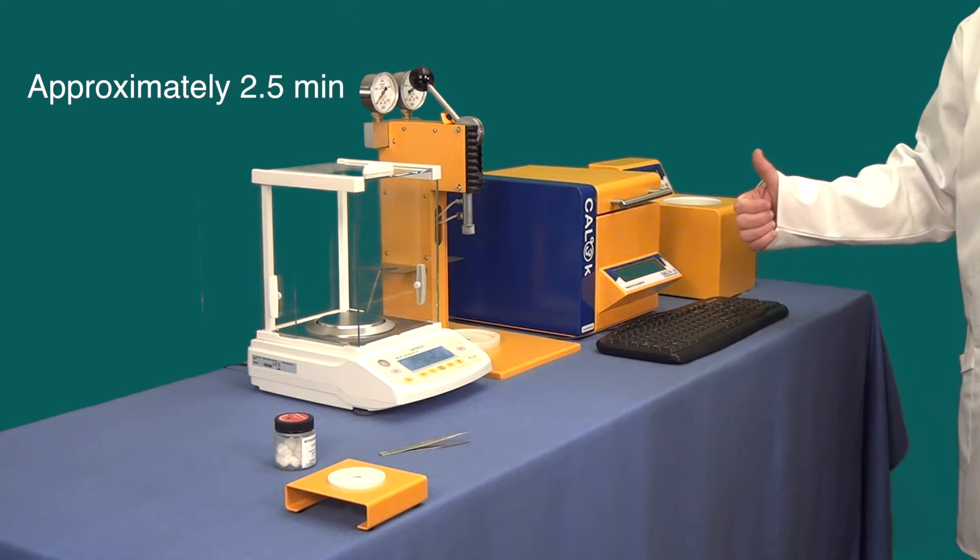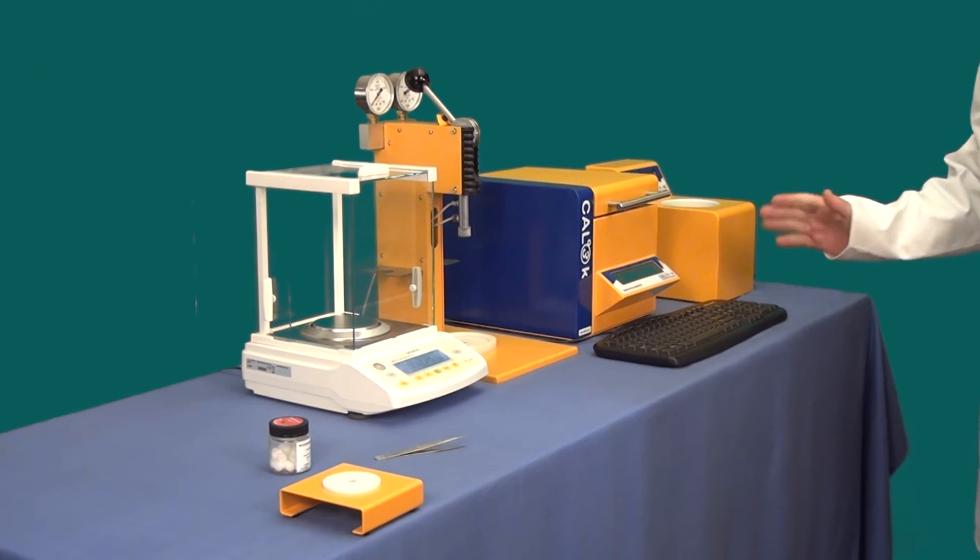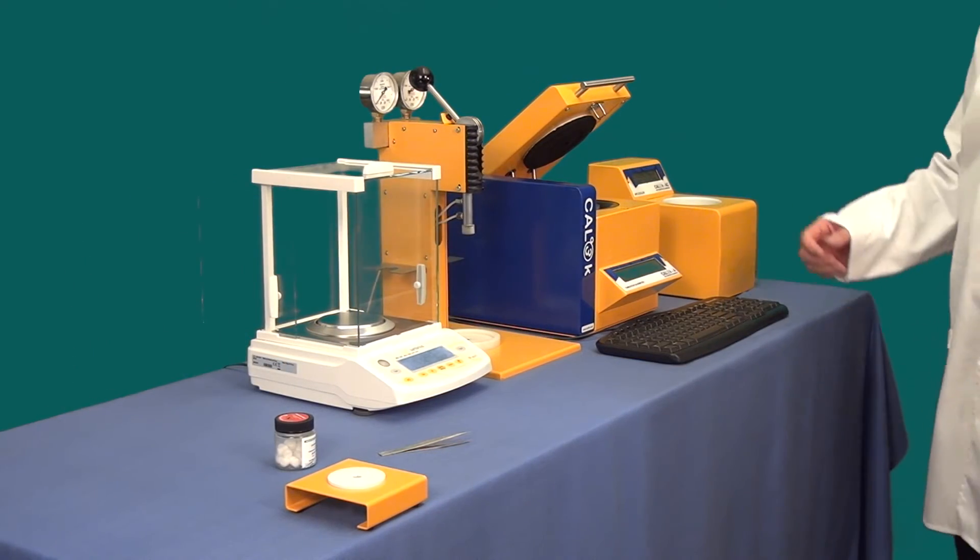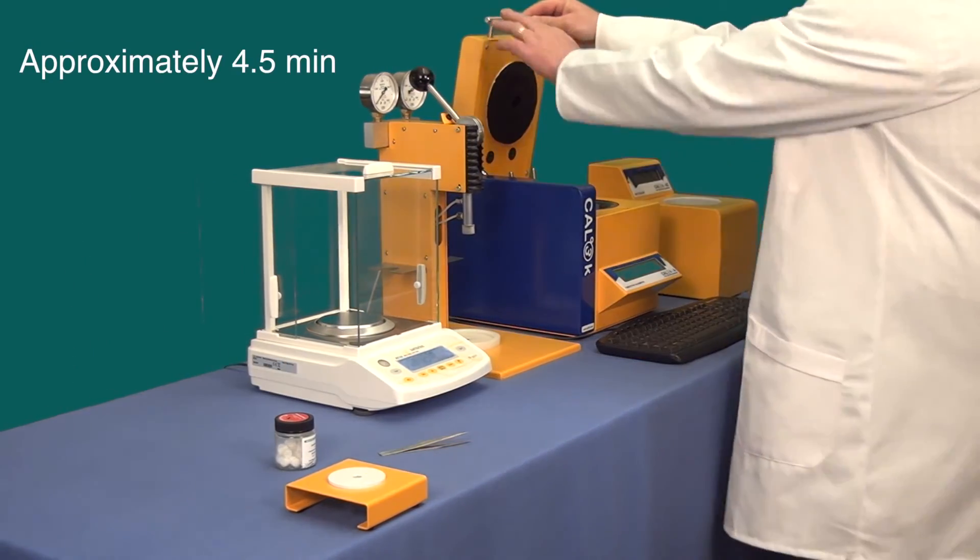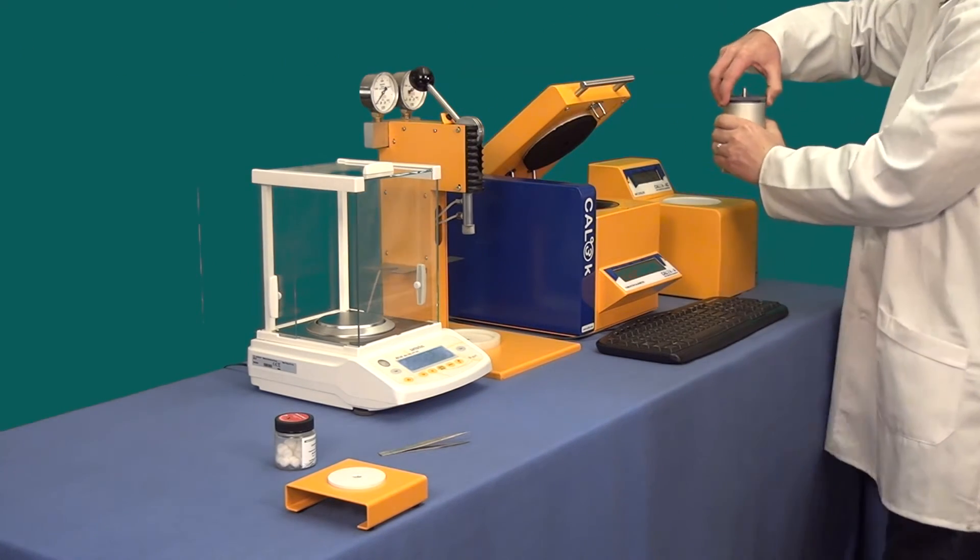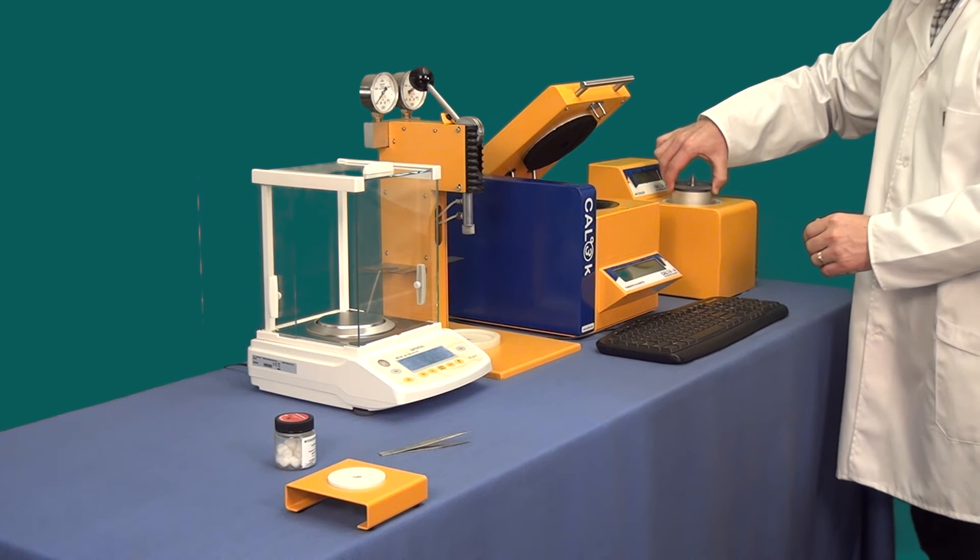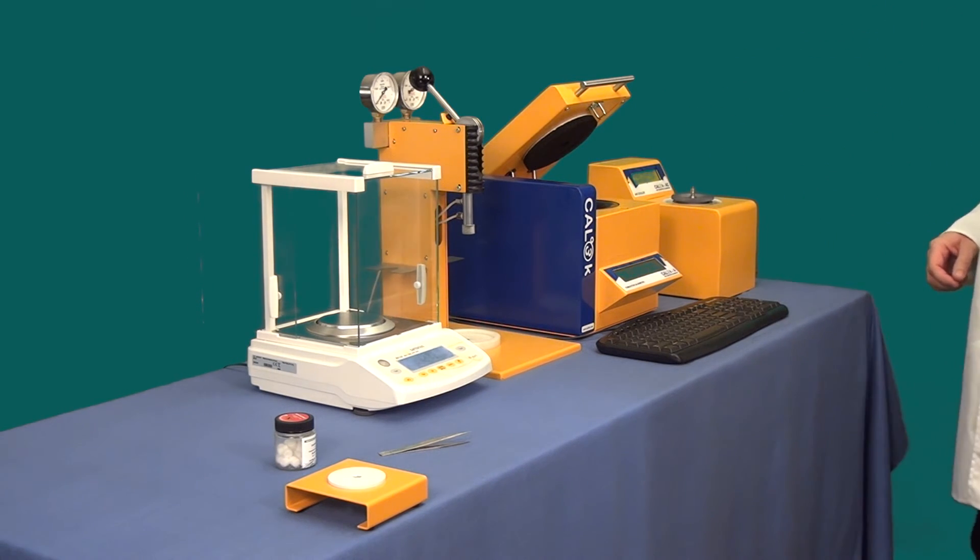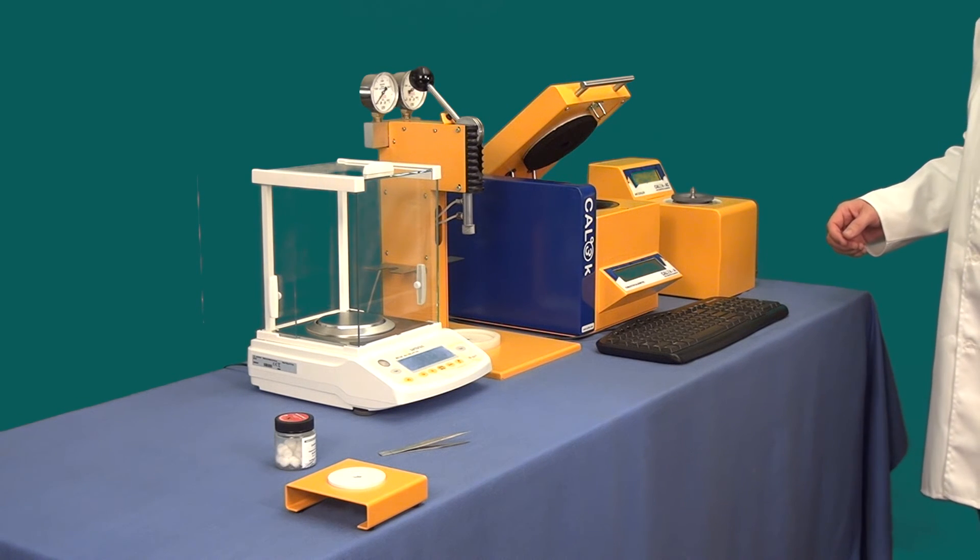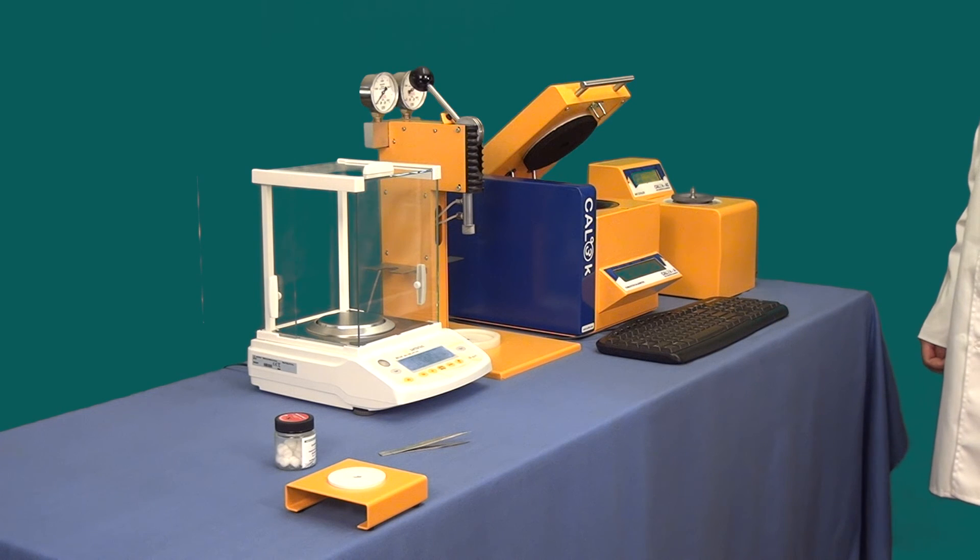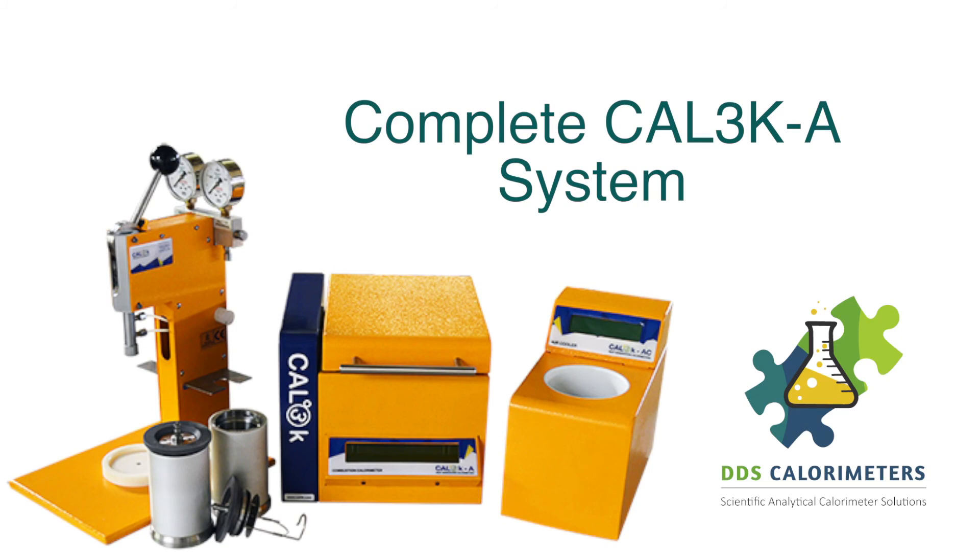Now the calorimeter has fired and we need to wait another two minutes for the determination to finish. Once finished, the lid will automatically open allowing you to remove the warm bomb vessel. The bomb vessel is approximately 14 degrees warmer than ambient at this point. Place the bomb into the cooler and the cooler will now proceed to cool the bomb vessel down. The cooler will also indicate the time required till the bomb can be used again. That's it.